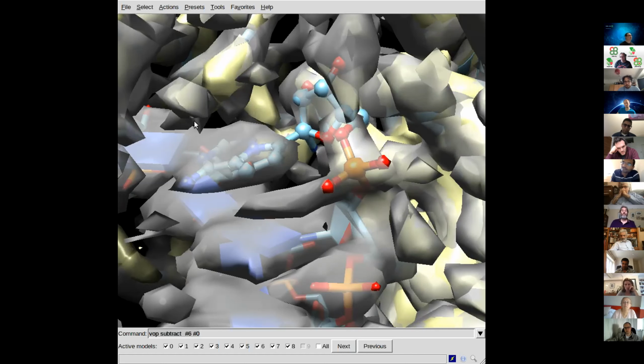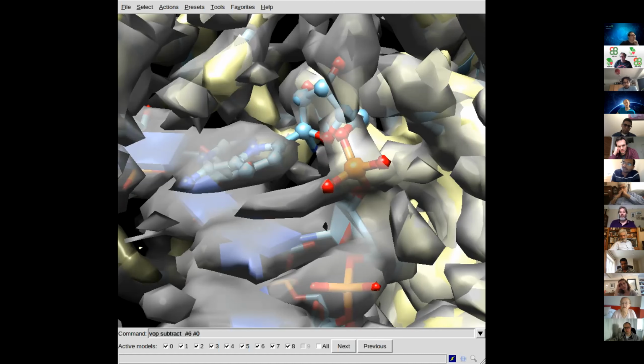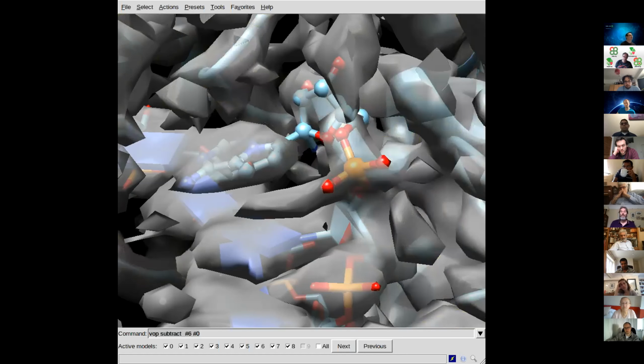My computer's a bit slow. We'll come back to that. So basically, if I do difference maps on aligned maps of these two maps from this group, the RNA map versus the non-RNA map, you see a really nice density for the RNA and the phosphates, as little blobs. And I aligned those independently of the models. So it's really nice, potentially another way to validate the maps.